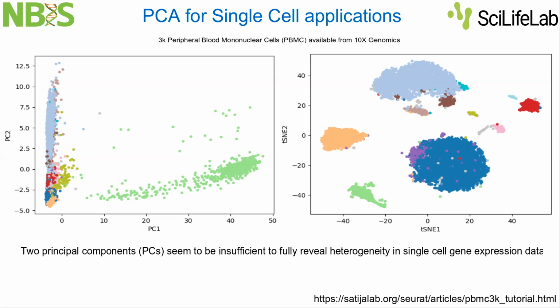And the solution here, so basically what we see here is that there is nothing wrong with PCA. It turns out that two principal components are not informative enough for our purposes. So you should either consider more principal components in order to get a better picture.